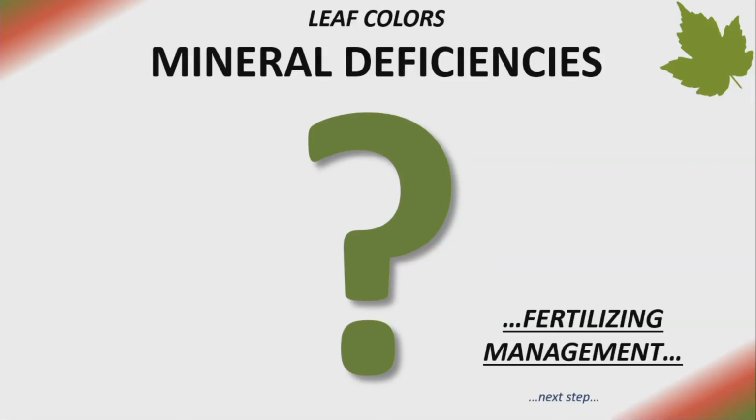The next step, we are already preparing the experiment, but I do not have results for the moment, is to move to leaves, and we will study mineral deficiencies. So we are preparing the experiment to check different mineral deficiencies, and we think that if we are able to produce indexes, maybe they could support fertilizing management or precision viticulture in the near future. This work will be done with Daniele Grossi, and let's hope to have good results.